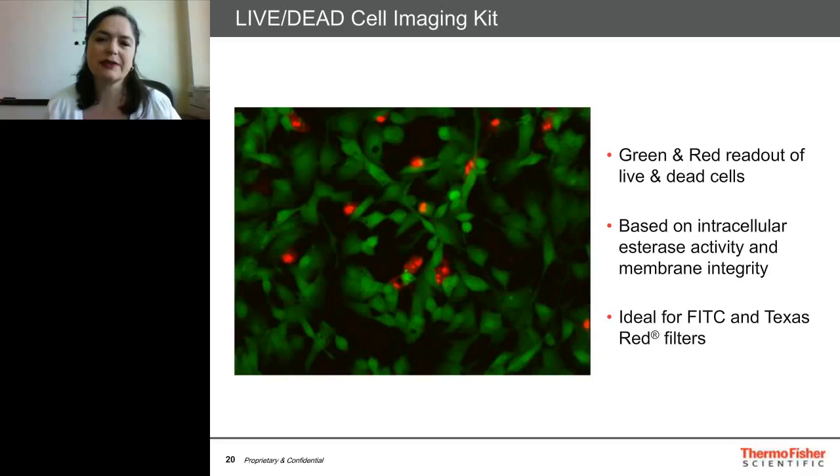So what you saw there was that the cells started out green and healthy. That was their live cell indication. And then what we did at the microscope is we actually poisoned them. We pipetted in a bunch of DMSO that basically blew up their membranes and killed them, and you saw that loss of green fluorescence and then the red indication that the cells were officially dead.